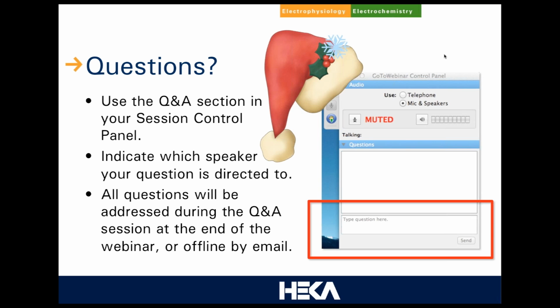Okay, so I propose, Telly, that you will get in contact with us, maybe the question later on directly. Maybe I can help here a little bit. I quickly glanced over that question as well. So it looks like those cardiomyocytes, you may not depolarize them far enough or for long enough to have the voltage exceed the threshold and to elicit an action potential. But it's quite clear for this question we are gonna need more information what specifically the experimenter is doing, and then we will be happy to address that. So we will contact you offline and then make a compilation of this question and the answer, of course, available in that list of question and answers that we're going to publish, as Lars mentioned.